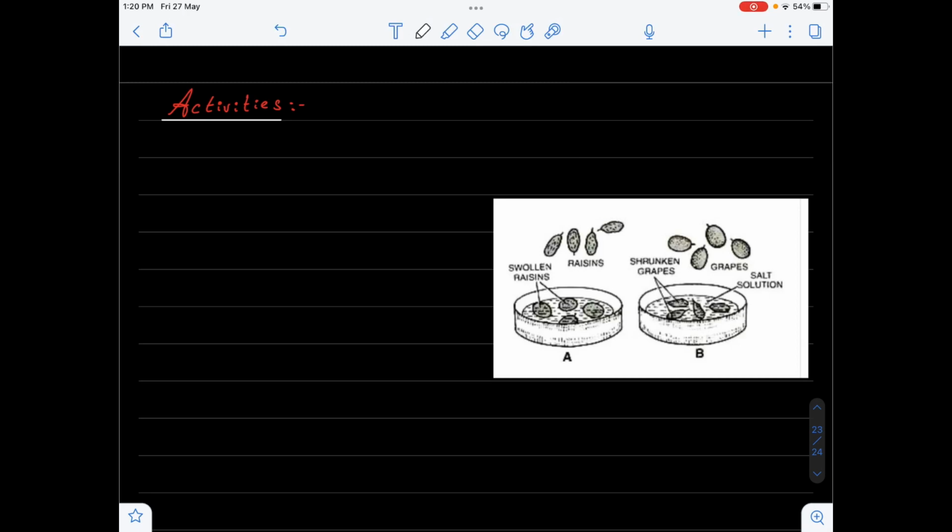Hello everyone. In this video we will discuss demonstration of endosmosis, exosmosis and plasmolysis.